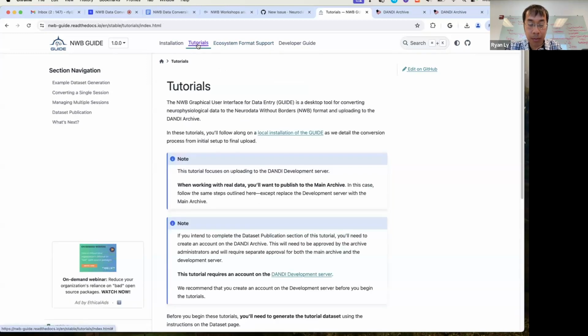Okay, now moving on to the tutorials. In order to complete the full length of the tutorial, we highly recommend that you register for the DANDI archive, the main archive for storing neurophysiology data supported by the US BRAIN Initiative. If you haven't registered for DANDI yet, that's okay. You can just follow along on that part of the tutorial, and we can help you later, or you can try the upload process later.